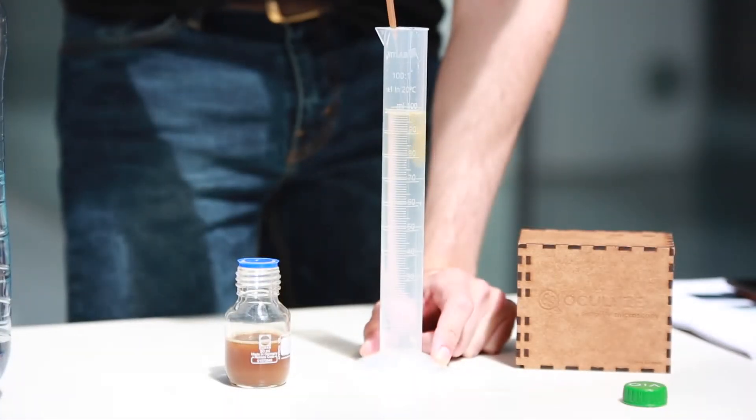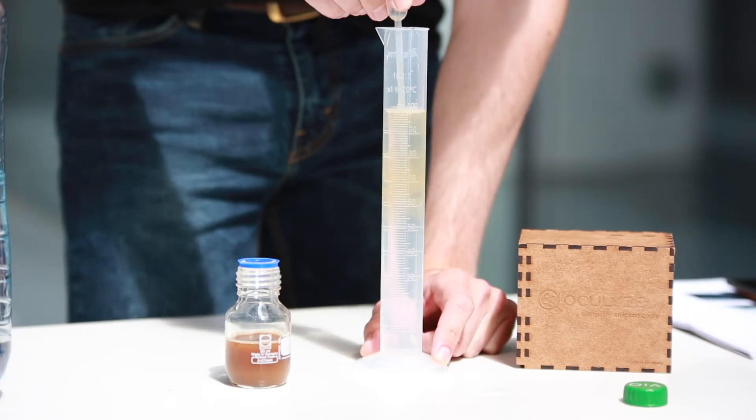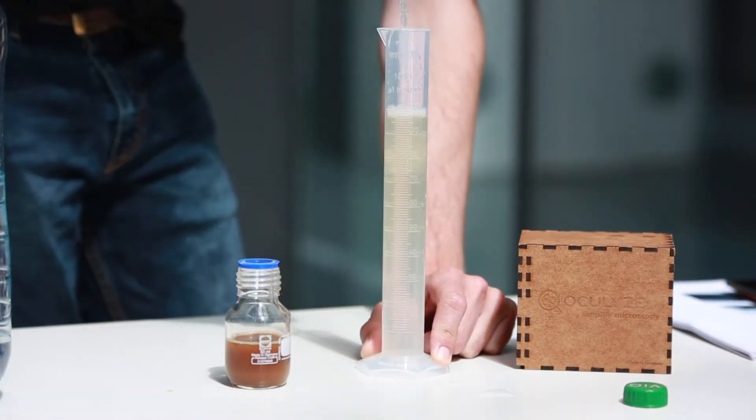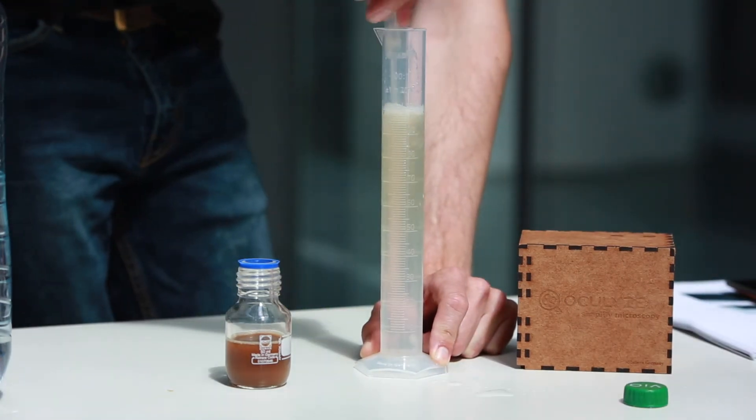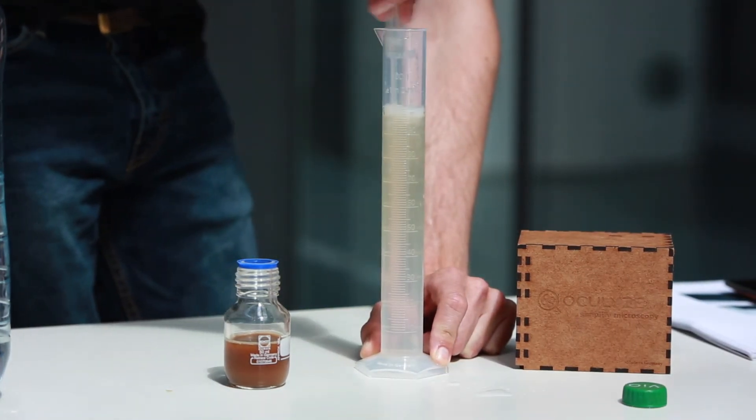Step 3: Empty the Pasteur pipette into the measuring cylinder. Step 4: Run the solution in and out of the pipette 3 times. Step 5: Take the Pasteur pipette and stir a few times.